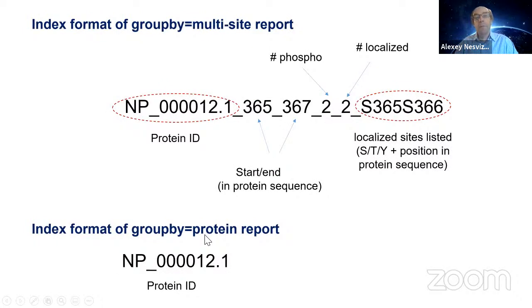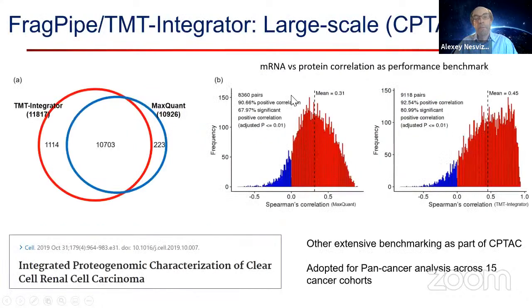An important part of that is how we generate site-level reports, where we couple it with PTMProphet, for example, for site localization for phospho data. We also need to summarize this with respect to what sites we localized and not. So we create these site-level reports that I try to explain on this slide, but I don't have too much time now.